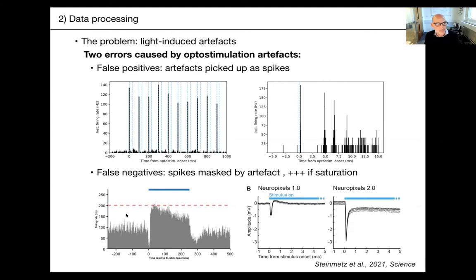An example of a false negative: don't jump to conclusions thinking your neuron is inhibited by your stimulus — you may have just lost spikes. Usually what you do is ignore what's happening at the onset of your stimulation. But apart from that, you can use processing tricks to hopefully get rid of the artifact altogether and restore your data — though not if you have saturation.